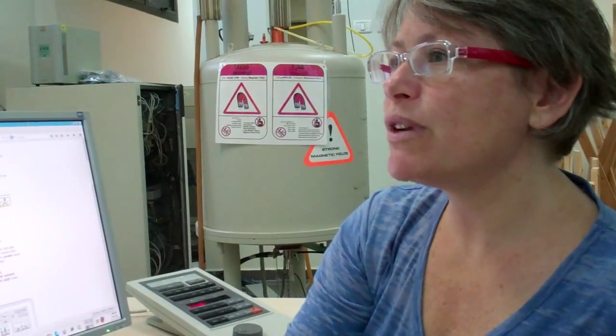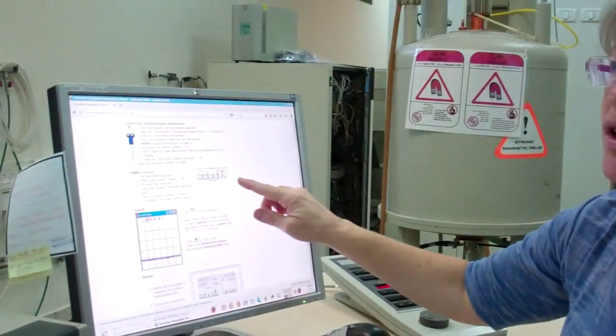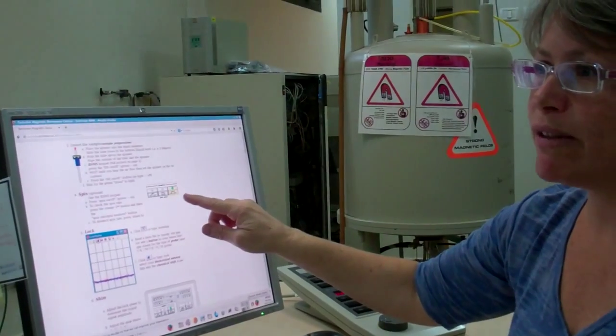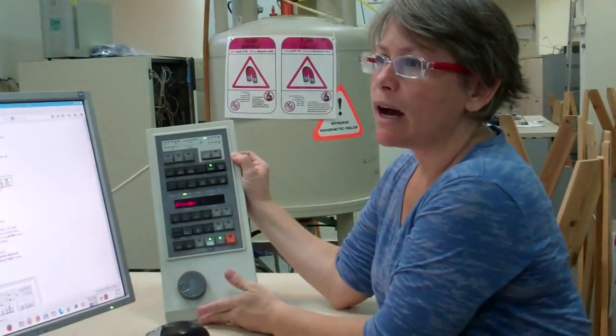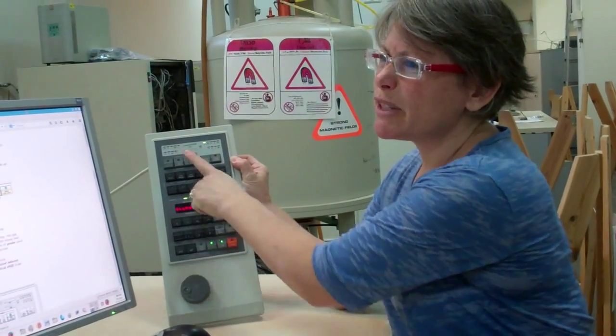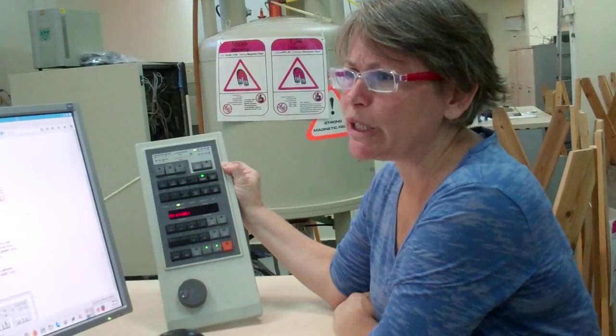We're now on step 3C of the instructions. Notice in the instructions, the buttons in the picture have labels. You can use that to figure out the location of the button on this BSMS keyboard. On the actual buttons that we use the most, the labels have been rubbed off from frequent use.